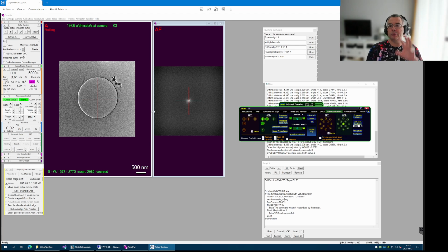In principle, you could do even lower mag. I would just not recommend crossing the mag boundary to the lowest possible in the mag 1 range. So 1,000, 1,200, 2,000, these are normally not good because there is a huge rotational component, and this will invalidate the alignment.